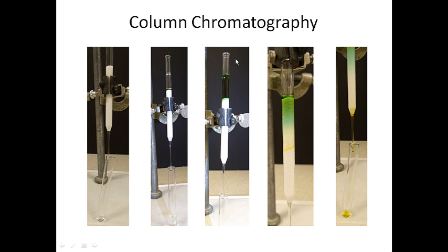And then I'm going to go ahead and it will basically flow down the column. And as it does, you'll see that the beta-carotene pigment begins to move down the column, whereas all the chlorophylls are stuck up here. Once the extract solution gets close to the top, you're going to add more pure hexanes to this column, probably just a few milliliters at a time. Eventually this beta carotene band will move down the column and it'll start to elute off of it.